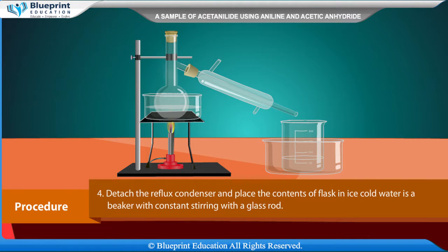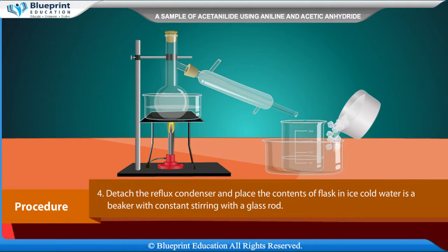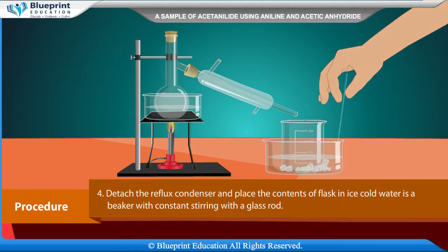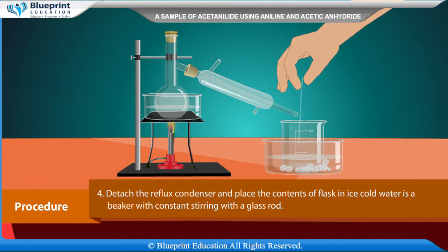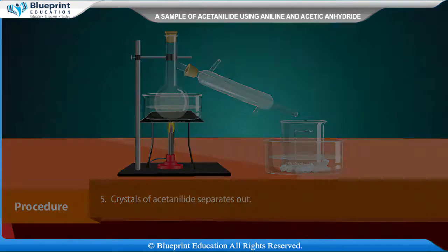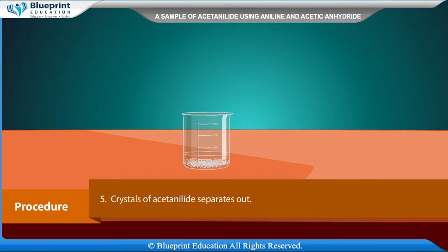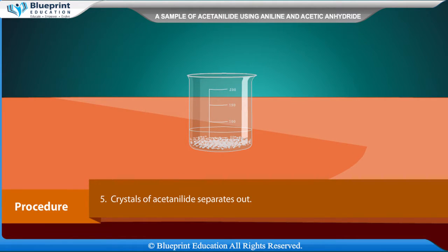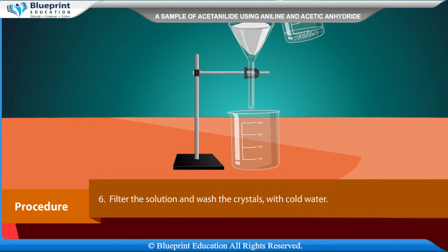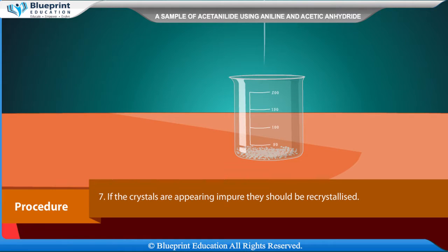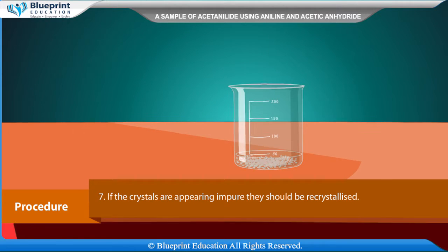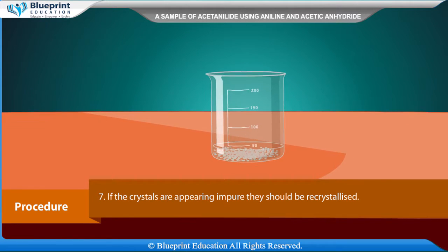Detach the reflux condenser and place the contents of the flask in ice cold water in a beaker with constant stirring with a glass rod. Crystals of acetanilide separate out. Filter the solution and wash the crystals with cold water. If the crystals appear impure, they should be recrystallized.